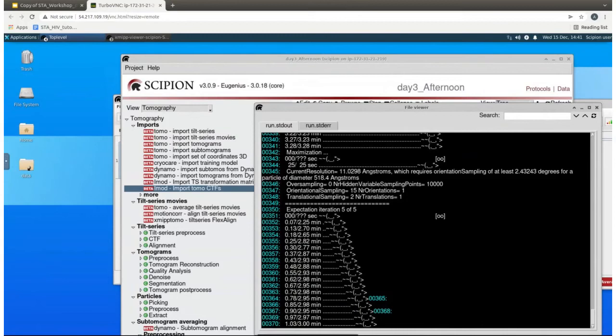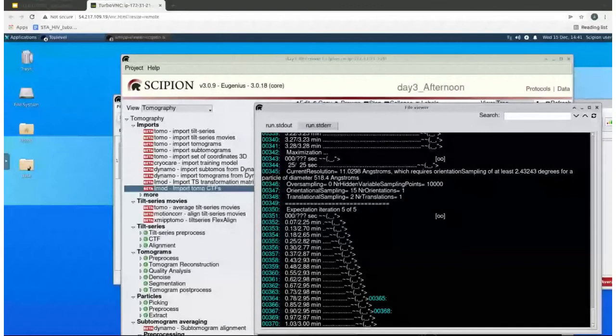Hi, Hannah. Yes, Scipion has the eTomo program with IMOD, and in that interface, in the manual one, you can use the patch tracker. So yes, you can align without fiducials, but manually for the moment. And I don't know if there are other options. Maybe Pablo or Vilas can tell you more, or Federico, if he's there.